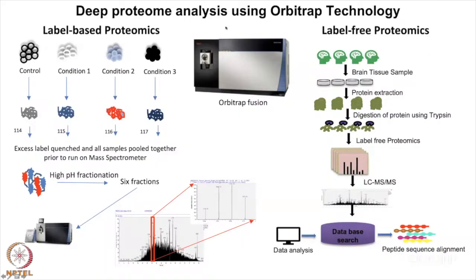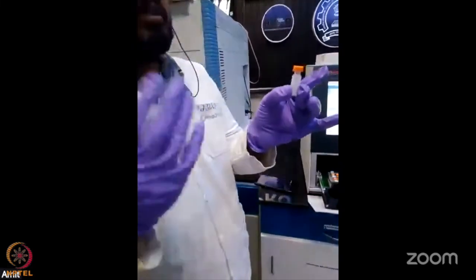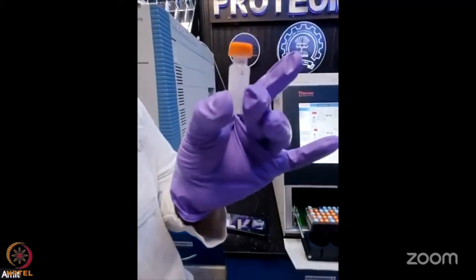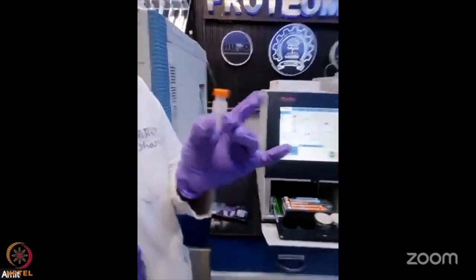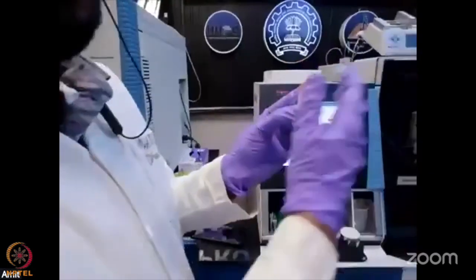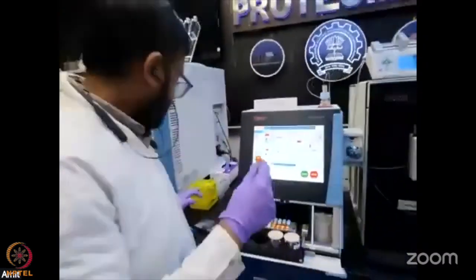So, hello everyone. Good morning, everyone, and welcome to the side session. I think Amit has shown how we have taken the samples and performed the peptide quantification. Now, if we want to do the mass spectrometry analysis, these are the tubes or vials in which we keep the samples for the mass spectrometry, the Orbitrap Fusion or tandem mass spectrometry that sir was mentioning. But before going into the mass spectrometry or the MS/MS, it is actually LC-MS/MS that we generally talk about.